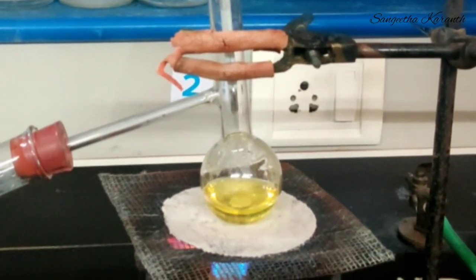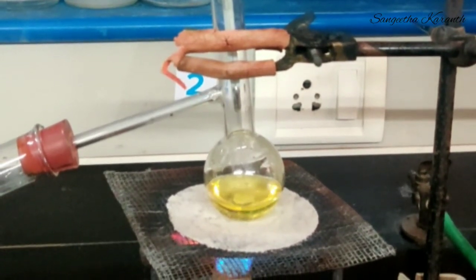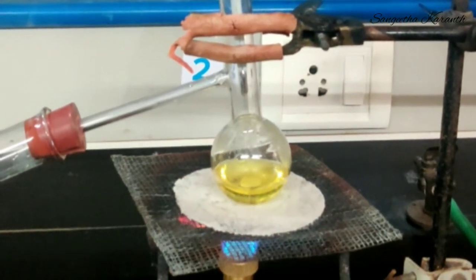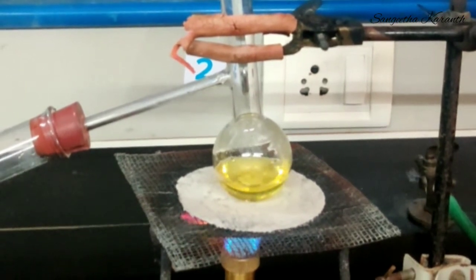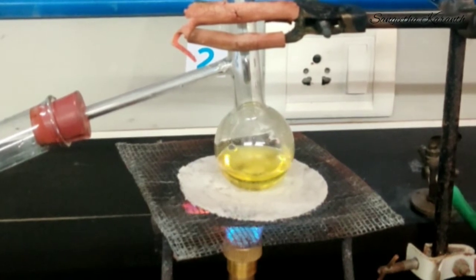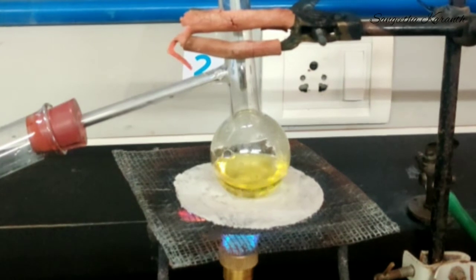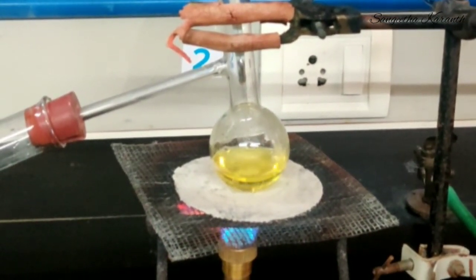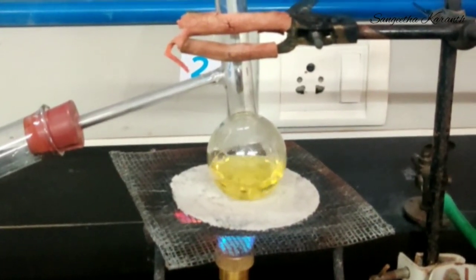These vapors will pass from the RB flask and move to the condenser. In the condenser, the vapors will condense and the pure liquid will be collected in the beaker. The constant temperature at which the vapors get collected in the beaker, because of the boiling of the liquid, is called the boiling point of that liquid. We need to note this constant temperature and report it as the boiling point of that particular liquid.